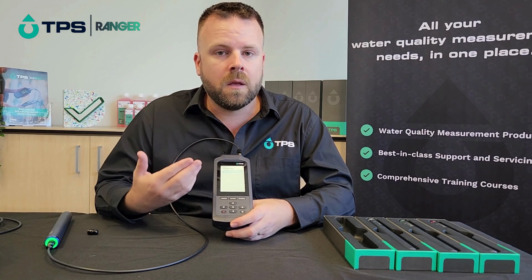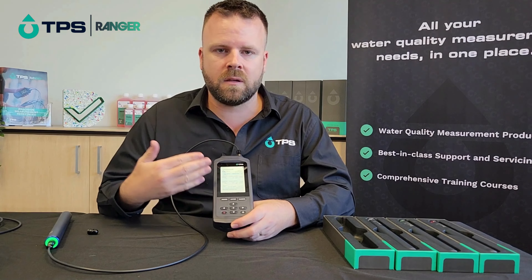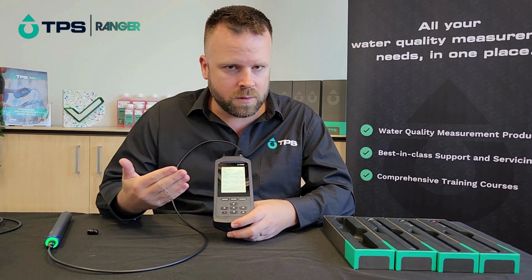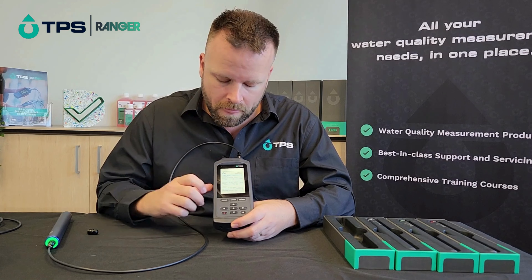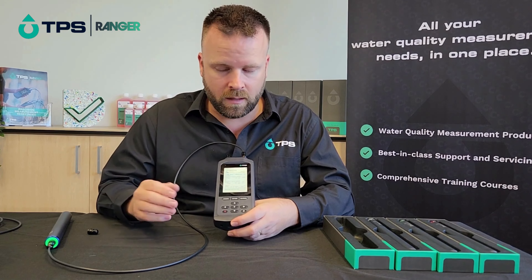We've only got one sensor plugged in so that's the one we can use. If we jump into that screen we can see a little bit of the history of the sensor — when it was last calibrated, what it was calibrated with, and a health indicator. At this point, if we wanted to, we could go ahead and perform a calibration.